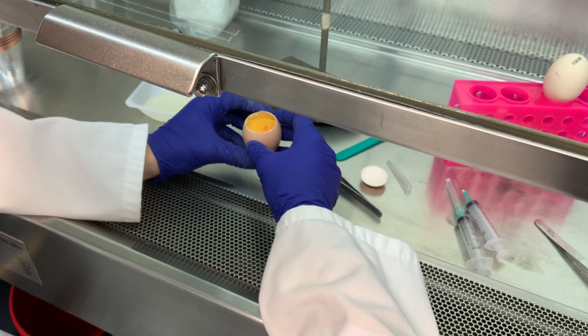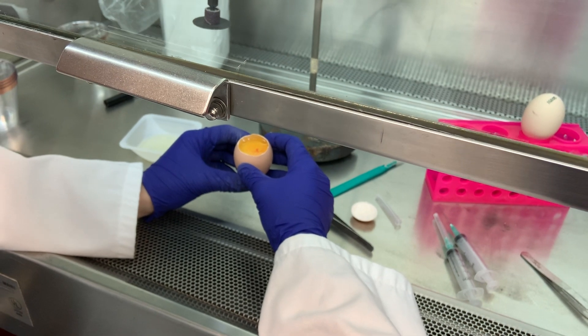And if we were to look closer, we could probably see a heartbeat here on embryonic day three.